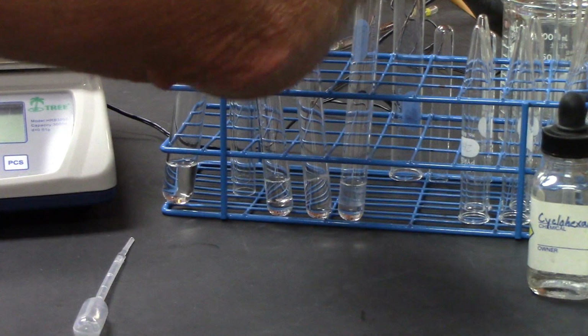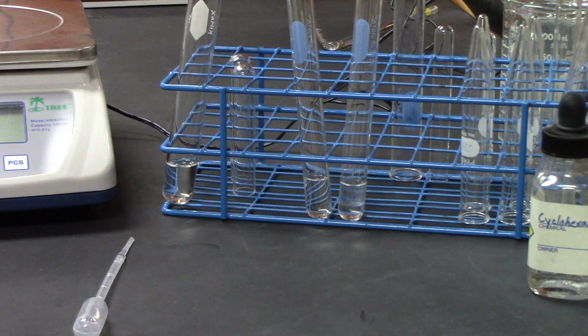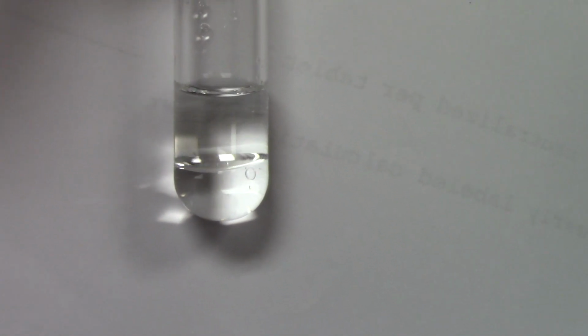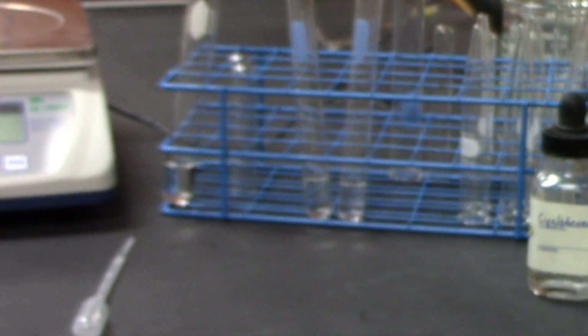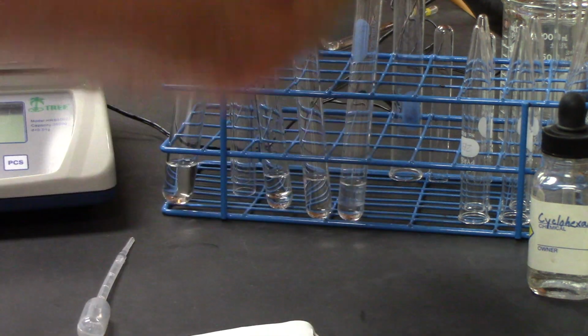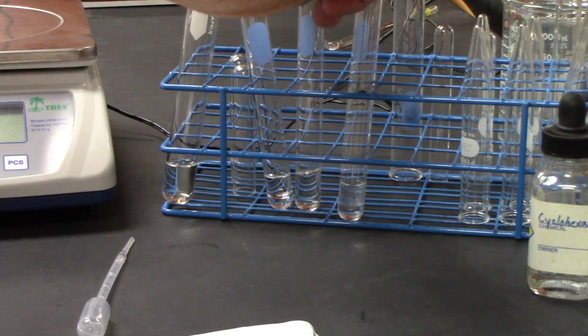Okay, let's do the water again. I have it up against the backdrop here, and there you go. Okay, and you can clearly see that there's a separation between the water and my unknown. Okay, so water and my unknown are insoluble. Cyclohexane and my unknown are soluble.